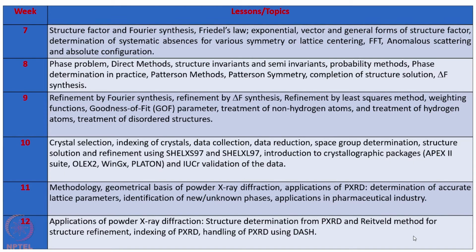Then we will introduce you to the phase problem. We will talk about direct methods, Patterson methods, Patterson symmetry and completion of structure using delta F synthesis. Then we will discuss refinement of the determined structures, refinement by least squares method, the weighting scheme, goodness of fit parameter, the R factors, weighted R factors and all that.